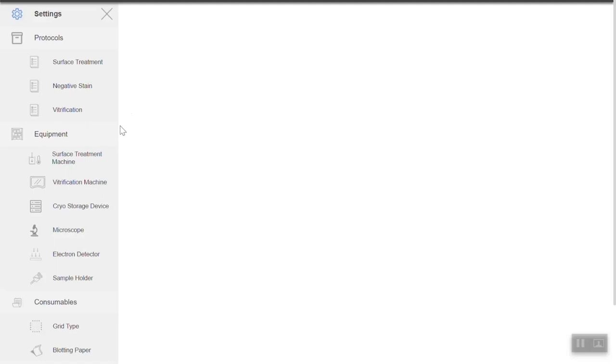Here, you will be able to add a number of entities that will allow you to record experiments in gP2S. Filling it in will provide information for various drop-down lists used throughout the system.